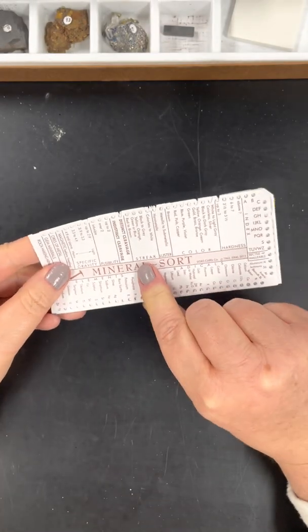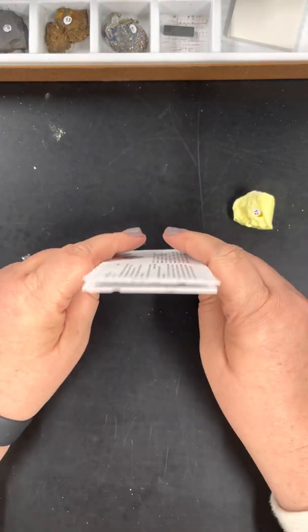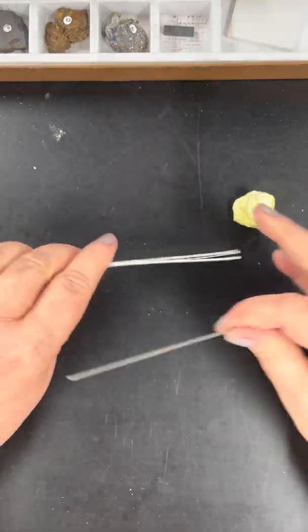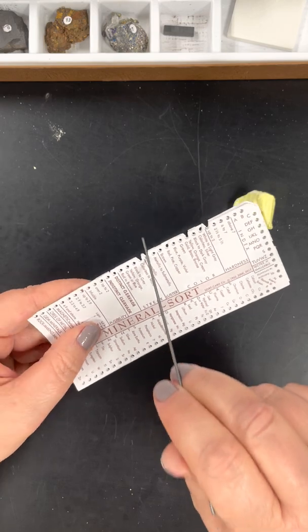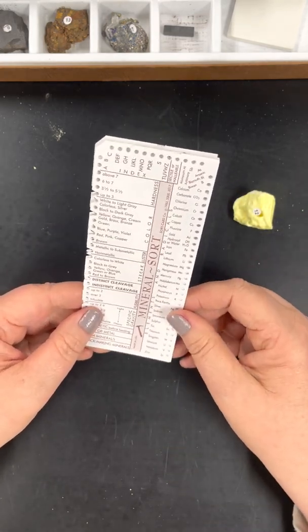So I'm going to put that back, and I'm going to look at my card, and I look right here at streak. Hang on, let me get it focused again. There we go. And I'm going to look at streak, and the color is colorless to white, black to gray, yellow, orange, green, or red. Well, here's the kind of crappy thing. All of them have that notch in colorless. So there's nothing I can do with that. They're all going to be colorless. All right. So then we go to cleavage or fracture.